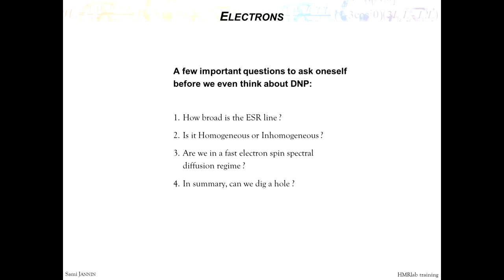But in any case, it's not related to the fact that the sample is solid, because in this case you also use a glass. In MAS DNP, they are at 100 Kelvin, so it's frozen, it's solid. For liquid, it's a whole different story.